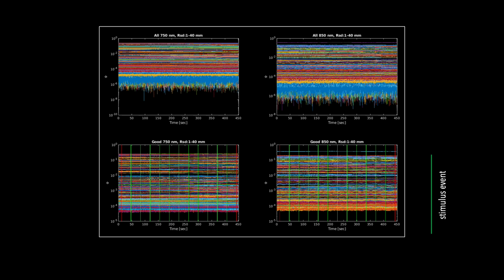The effects of applying this criterion can be reviewed in the raw data figure shown earlier. The bottom panels exclude measurements that failed the single-channel classification. A comparison of the top and bottom rows shows that channels exhibiting a large standard deviation have been removed and that the time series means are larger overall. Note the difference in the y-axis scaling. The results shown here are typical of the improvements that are obtained.